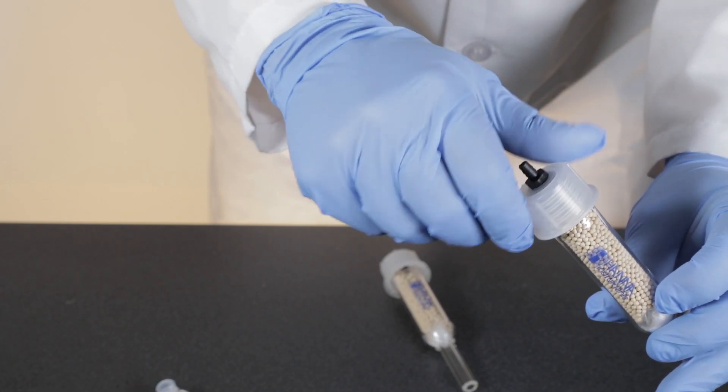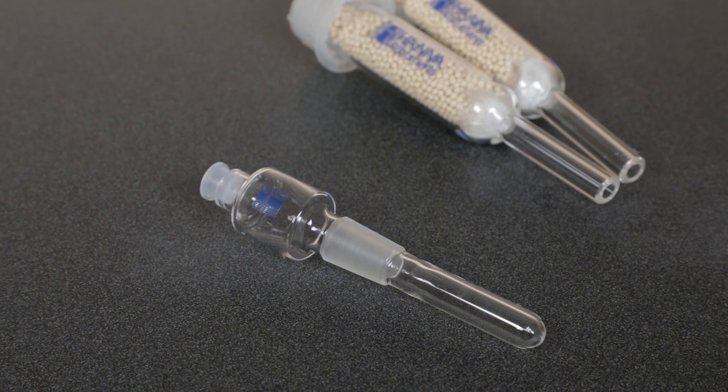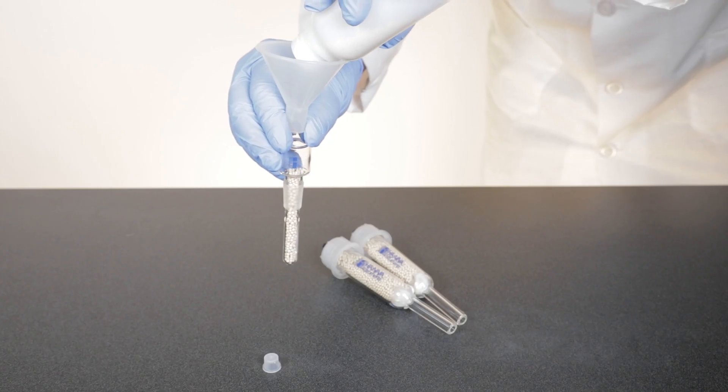After filling the cartridge, screw the cap back on firmly and make sure that no sieves have lodged in the threading of the cap. Fill the ground glass desiccant tube as well and replace the plastic cap when done.